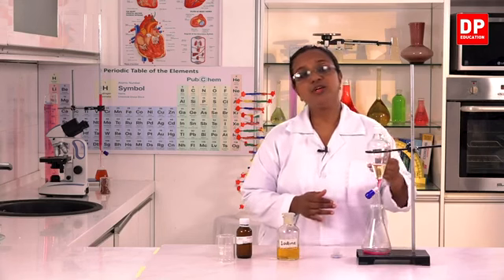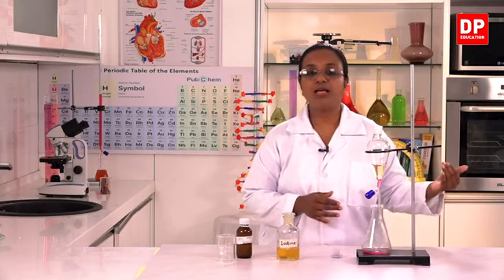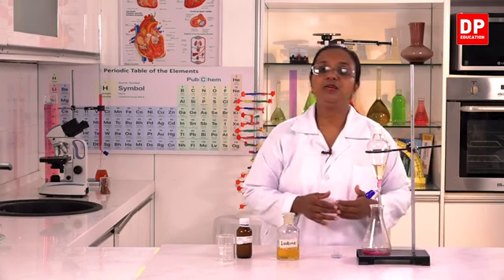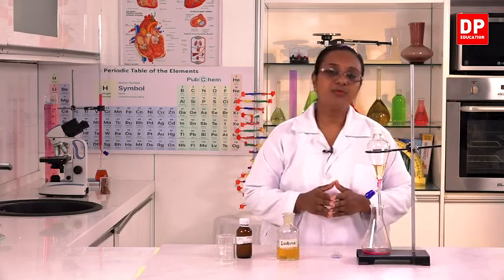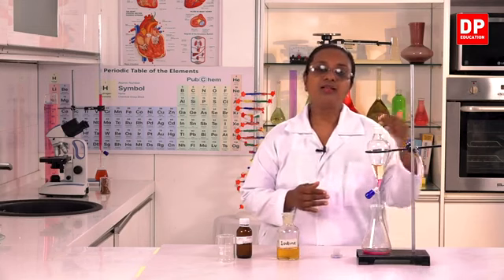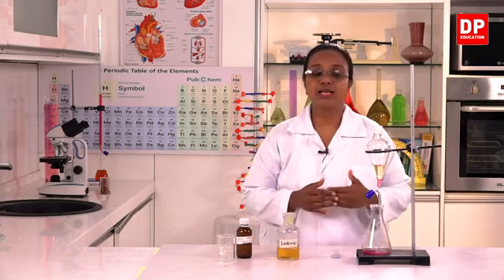In case you need to have the top layer, then you have to remove the bottom layer out first and then you can take out the top layer. So from this process, we can extract the solute present in one solvent into the second solvent.